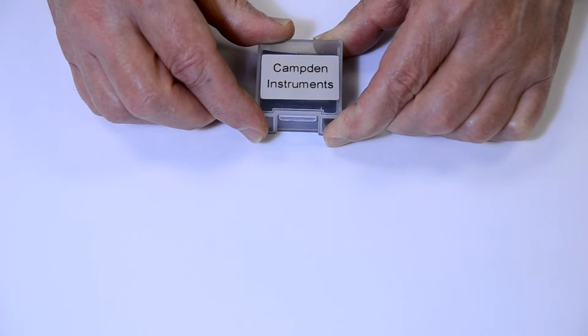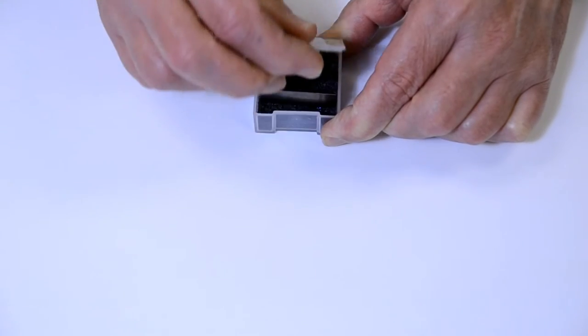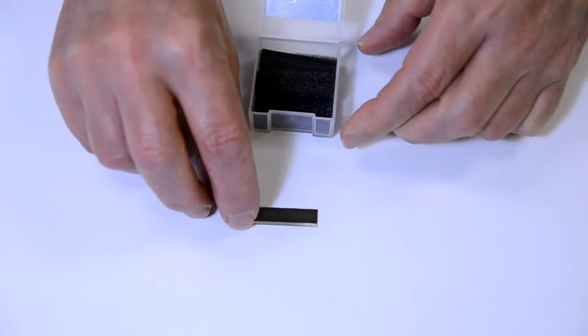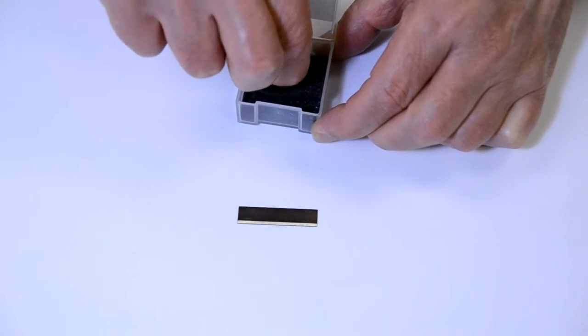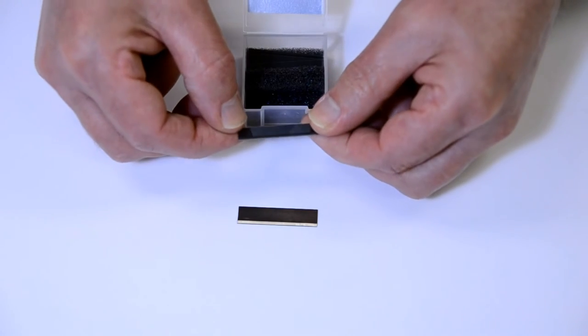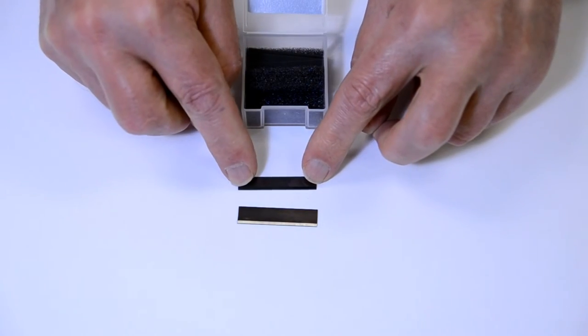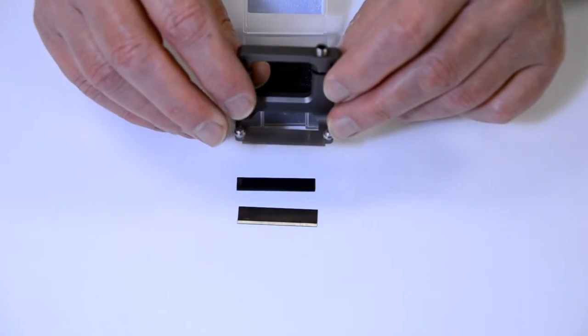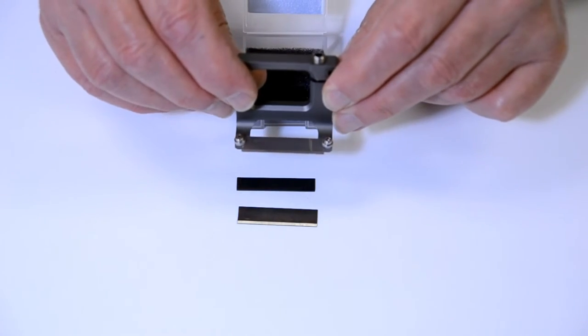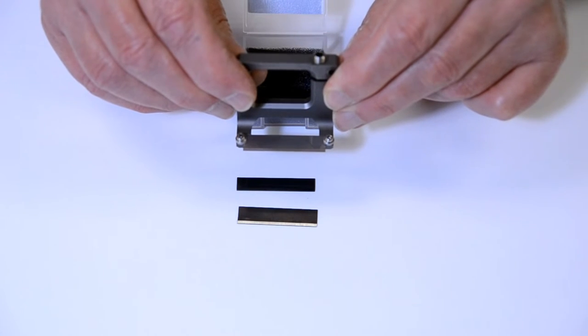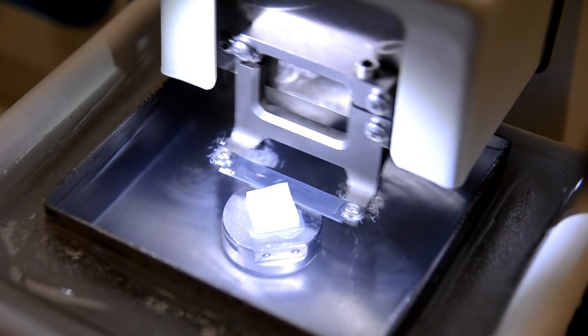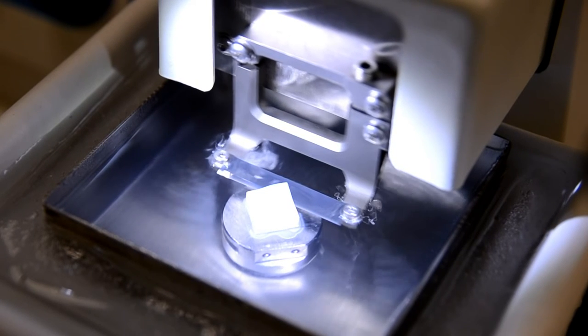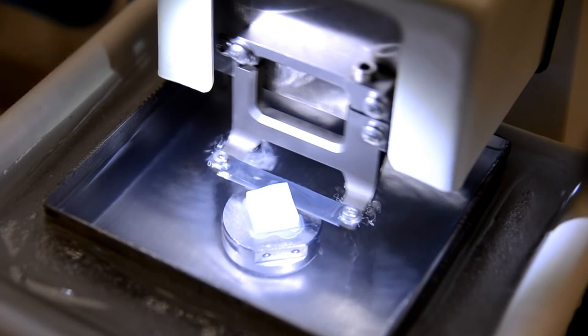Camden Instruments can supply two types of blade: one is made from surgical quality stainless steel and the other is made from zirconia ceramic. Although it is more expensive than the steel blade, the ceramic blade holds its edge for a much longer period. Note that uniquely the blades are located in the instrument by their ends. This holds the blade more rigidly than a central clamp and also allows the cut slice to travel over the blade and re-enter the bath fluid, helping to preserve the slice's viability.